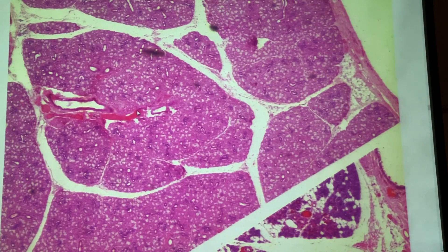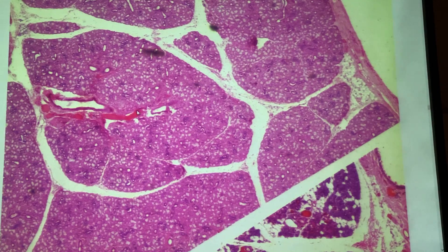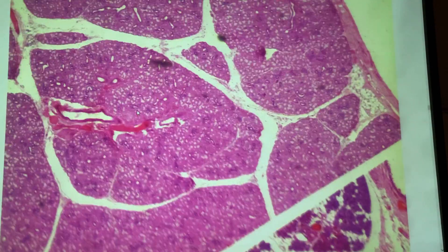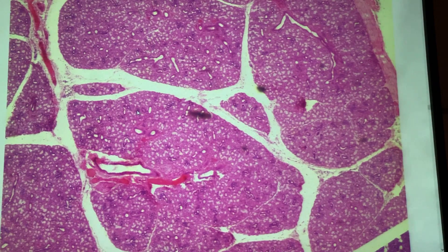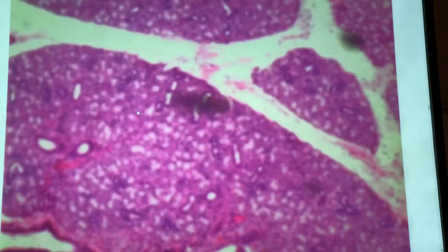Now these are the three different ones. You don't have to know which ones are which — you're not going to be asked if this is parotid, submandibular, or lingual. Just know that it's a salivary gland. This is on low power, so let's zoom in a little bit.